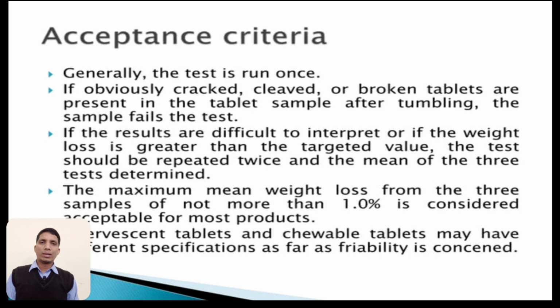Chewable tablets, effervescent tablets, or dispersible tablets may have different specifications as far as friability is concerned, as these are more fragile than regular compressed tablets. But if the tablets get cracked or break into two or many parts, then it fails the test.